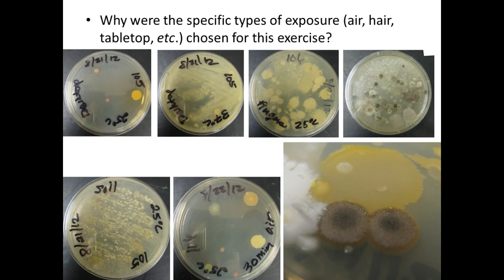So they asked why. If you read your lab manual, you'll notice that I actually changed it up a little bit. We did slightly different exposures than what they have there. The coughing one never comes out good, that's why I've abandoned it. And the hair scratching one too. Nobody really wants to do those two, and I don't blame them. And it's still kind of hard to get you guys to do the mouth and nose sometimes, but those always come out good because those are places where you have microorganisms naturally.